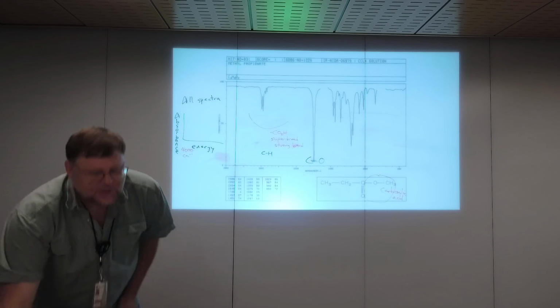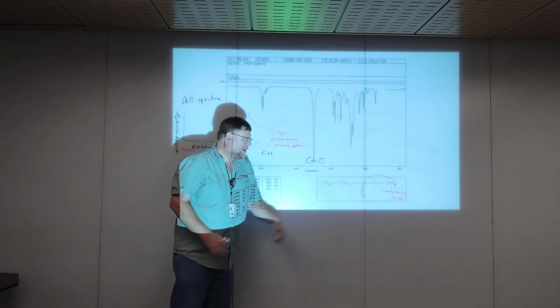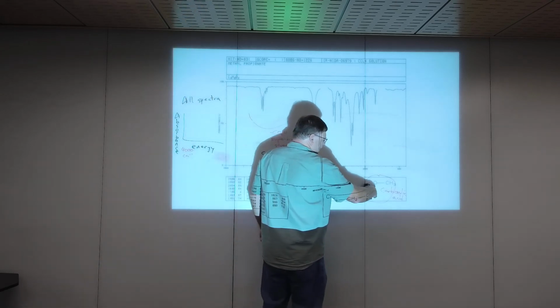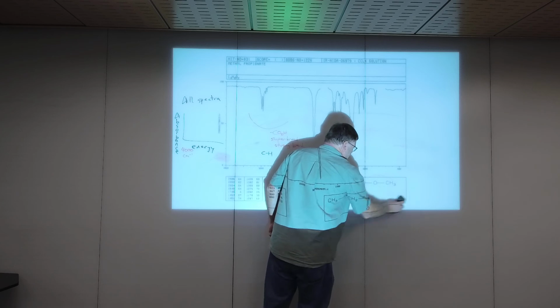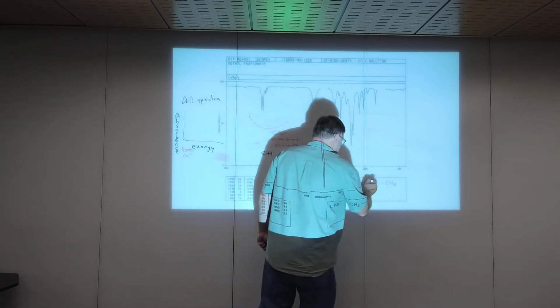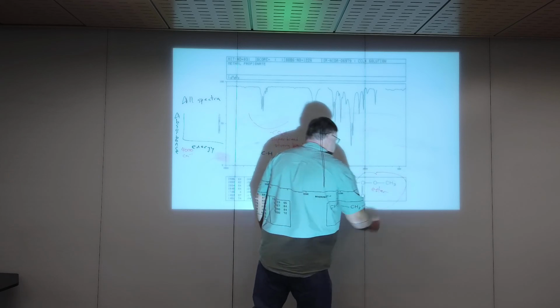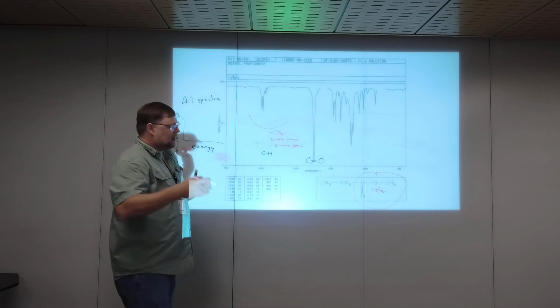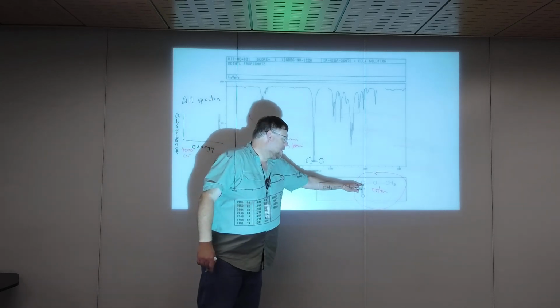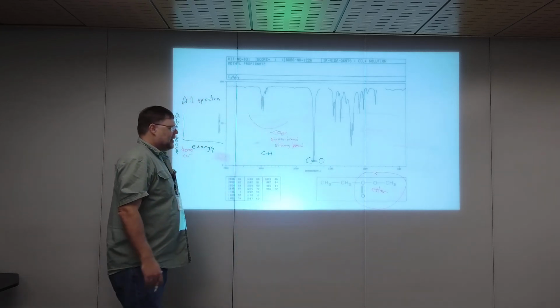All right, so let's look at this one. And again, look at that. That didn't change any. Here's the molecule down there. We no longer have a carboxylic acid. We've put a methyl in place of that H, and that changes things considerably. This is now called an ester. Again, carbon, oxygen, carbon is an ether, unless one of those carbons is a carbonyl, and then it changes the electronics. So we've got an ester.